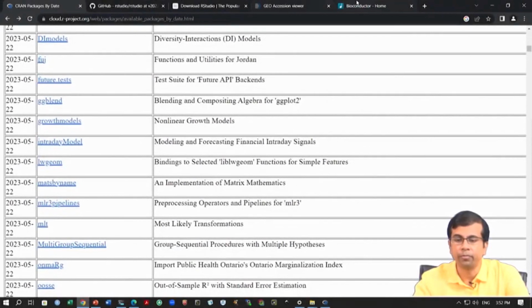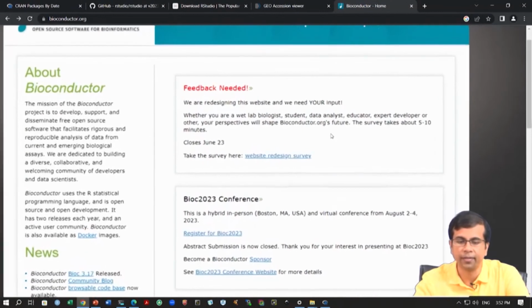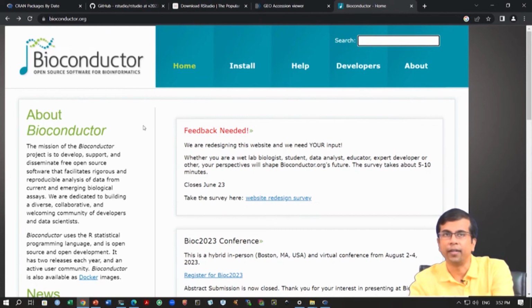Okay. When we were discussing the theory, bias correction, and different methods, we talked about some Bioconductor packages in R. Bioconductor is a part of R that contains all the packages utilized for bioinformatics. You will see a lot of the tools for transcriptomic data analysis are present in Bioconductor. So, the first one is DESeq2, and we will use this DESeq2.